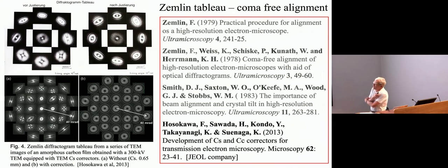And then, of course, this is now built into microscopes, and now the microscopes are made better, and without doing this, you don't get as much beam tilt error as they got. This would be maybe 2 or 3 milliradians of beam tilt error that was being corrected by counteracting it. Now it's probably only 0.3 or 0.4 milliradians, but still important.